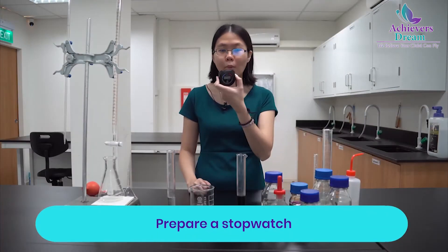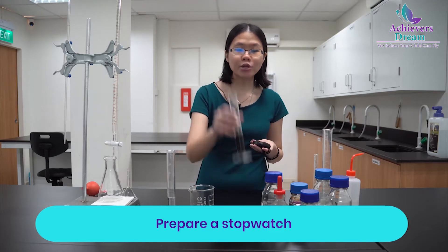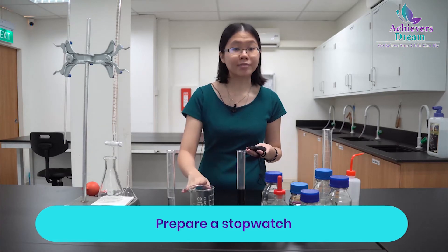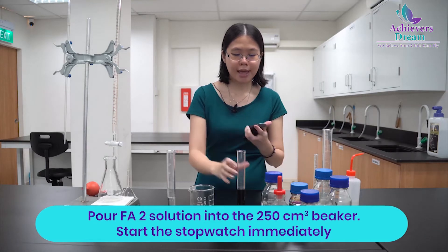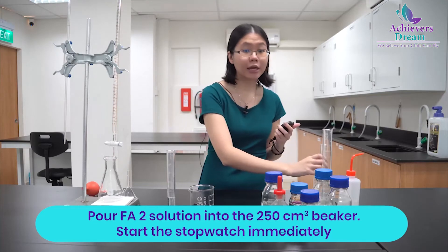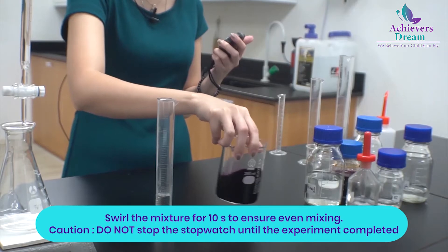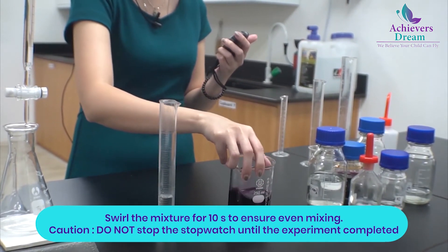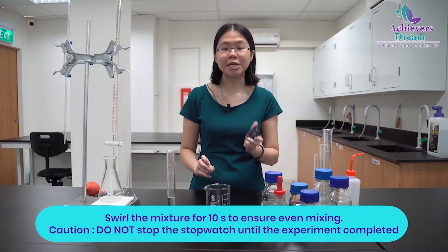Prepare your stopwatch and start it immediately when you add your FA2, which is your potassium manganate 7 solution, into the 250 cm³ beaker. Make sure your stopwatch is ready and once you pour it in, start immediately. Stir the mixture for around 10 seconds to mix it well. Once you have started the stopwatch, allow it to continue running for the whole duration of the experiment. You must not stop the stopwatch until you have completed your experiment.